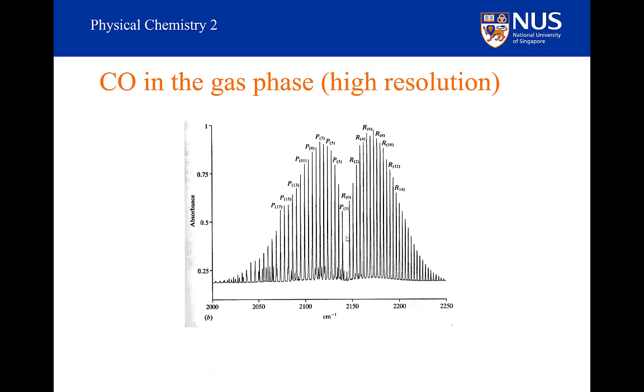Let's see what happens if we measure at a higher resolution. This is the kind of spectrum that we might see. And you can imagine what would happen if you averaged this spectrum over a range of frequencies. You can probably picture that such averaging would construct the previous low-resolution spectrum of the two separated broad bands. The distance between the two peaks in the low-resolution spectrum would roughly be this distance here.